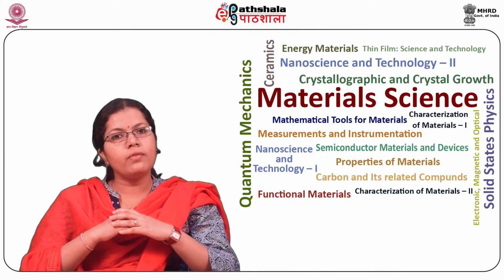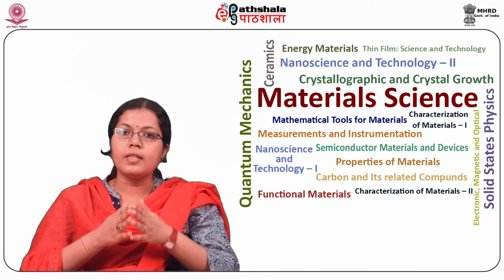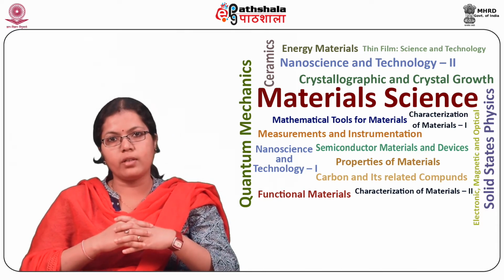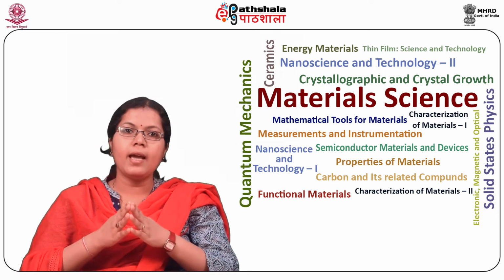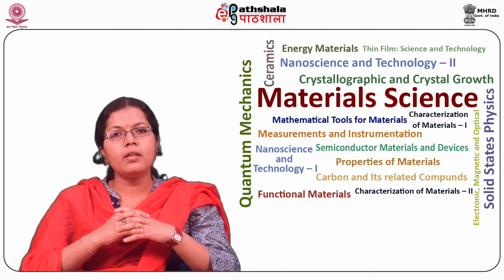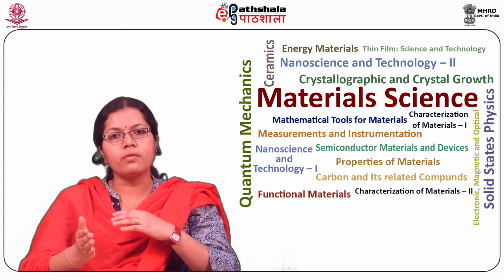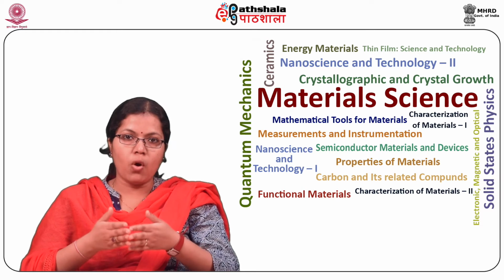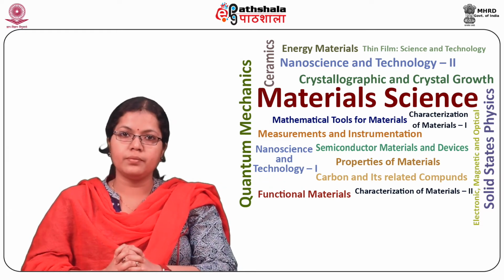The dual nature of electrons offers unique opportunities for the study of samples. The wave behavior is utilized in the formation of images and diffraction patterns. The charged particle behavior results in strong interaction with the atoms of the sample, giving rise to information on the chemical composition of the sample.